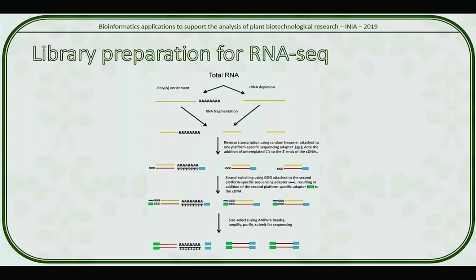And we do pretty much the same. We do the RNA extraction, we do the cleaning in the lab, we do the reverse transcriptase, and after we got cDNA, instead of cloning them, we start adding adapters, we start adding primers, we start with the next generation library construction, depending which machine you're going to use.